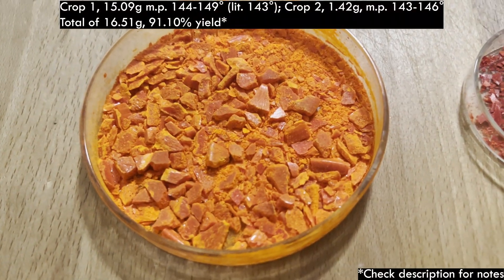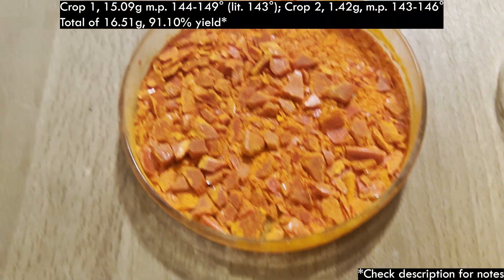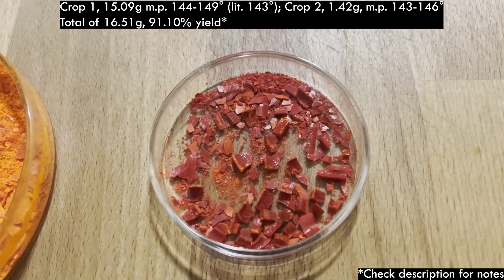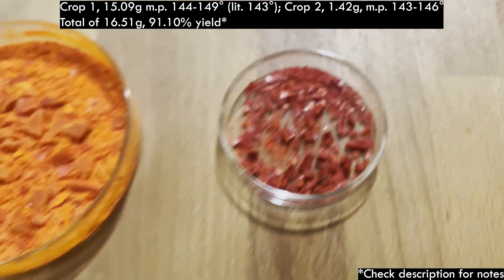Here are both crops of crystals, their weights, their melting points, and the total calculated yield. I'm happy with it. I don't know if there's anything I'd do differently — maybe shortening the reflux time, but that's pretty much it.